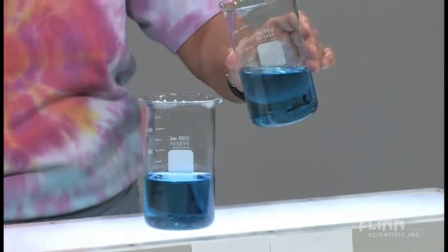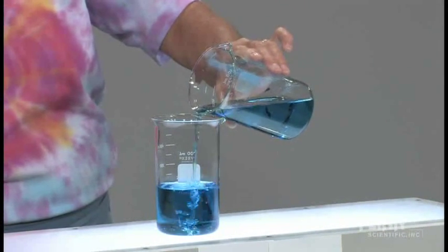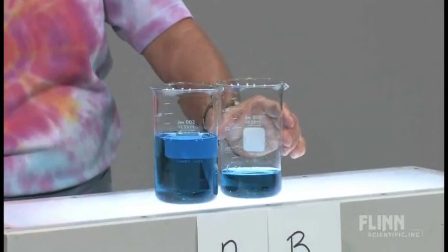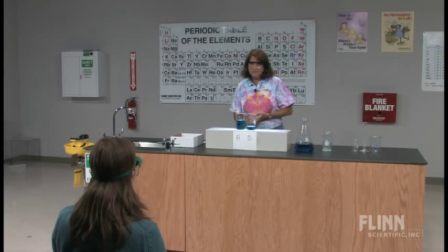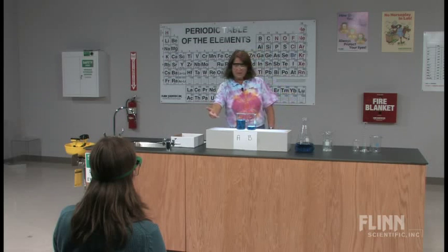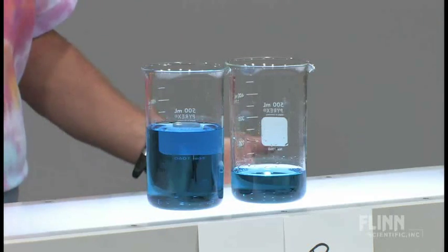We're going to take beaker B and pour half in. Everyone's got their answers — they've committed themselves. I've removed roughly half. When you look at the two solutions in beakers A and B, how do they appear? A and B appear to be the same color. She's viewing the beakers from a horizontal position, looking through beakers of identical diameter. So the appearance of the solutions appears the same.